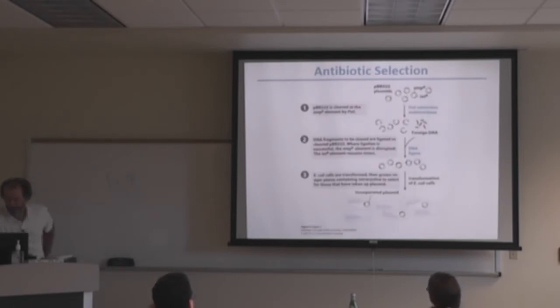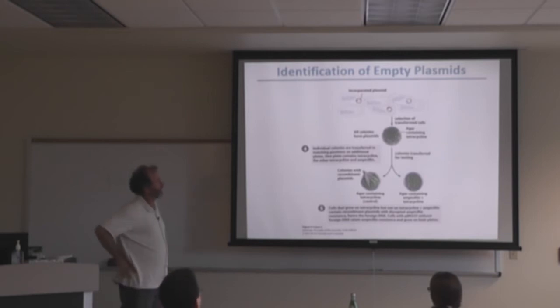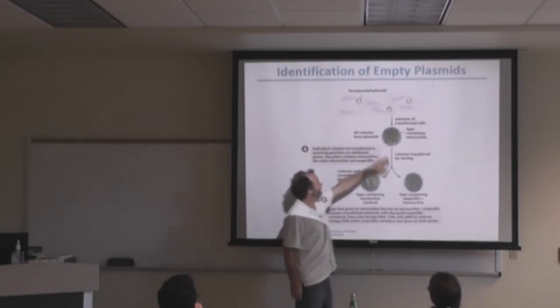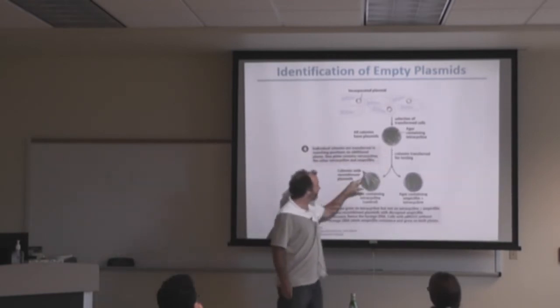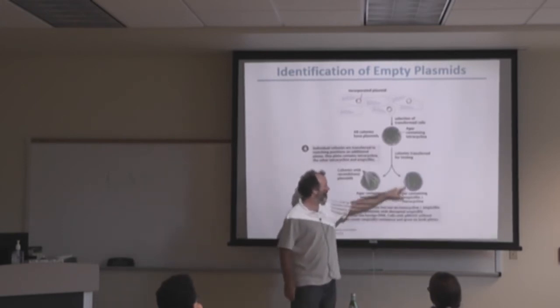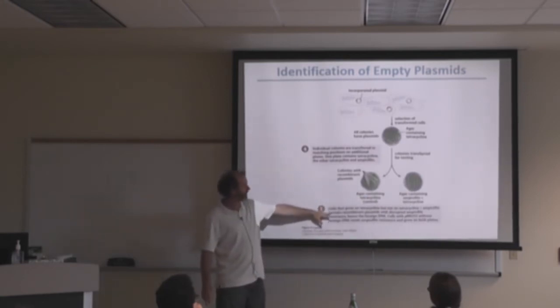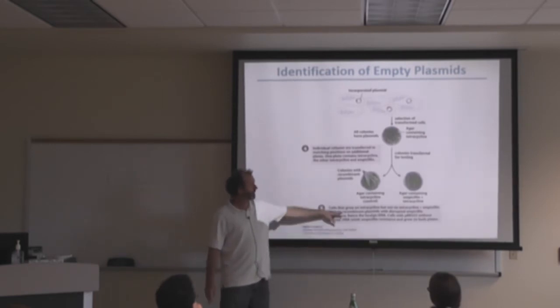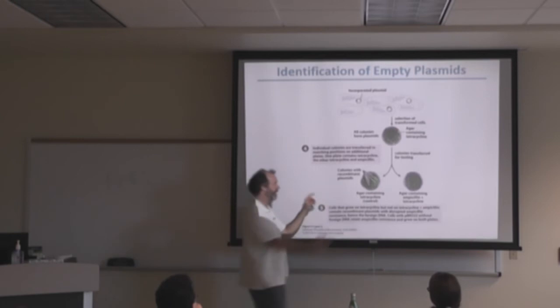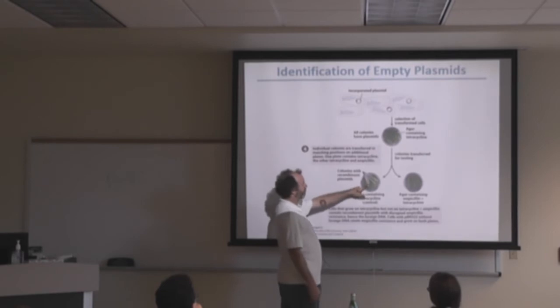And we've gone through this a number of times. They use this example here to isolate, and I don't know anybody who's ever done this. All colonies here are going to have plasmids. So they take the colonies out, and they spot little spots on agar containing tetracycline and then agar containing ampicillin and tetracycline. The cells that grow on the tetracycline but not on tetracycline and amp contain the recombinant plasmid with disrupted ampicillin resistance. So you can compare the two. The ones that grow here but not here are the ones that you want to save.